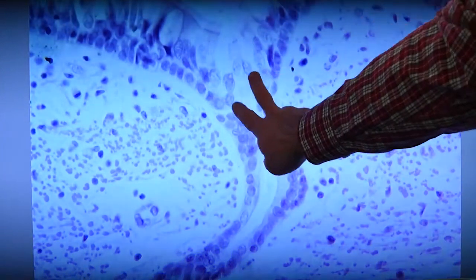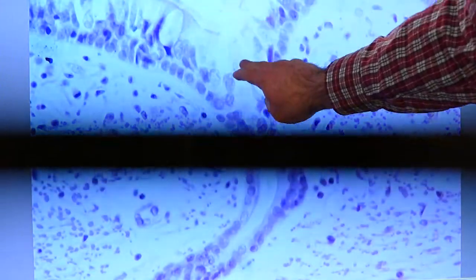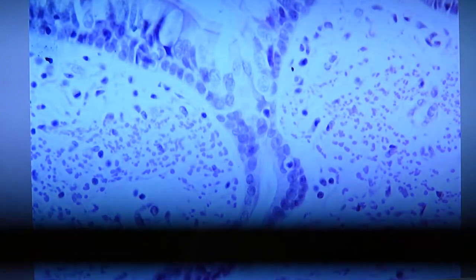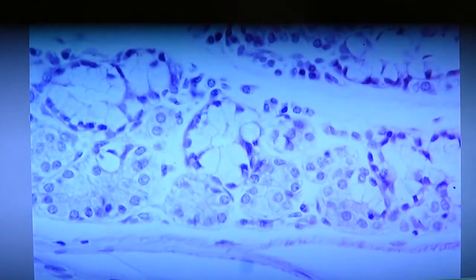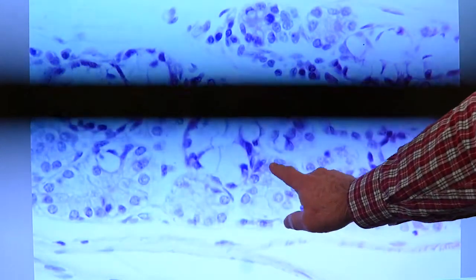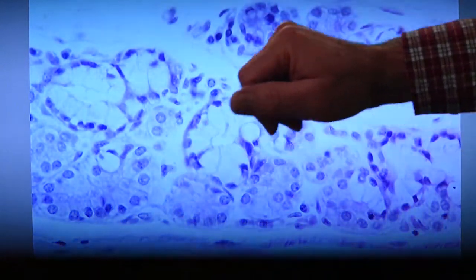This is that same duct I talked about earlier, that here's the mucus cells up on the top, and here we go into a duct of a gland, and right along here you see cuboidal epithelium, simple cuboidal. From that same slide, same coloration you notice on here, we have both serous portions and mucus portions of seromucous glands.